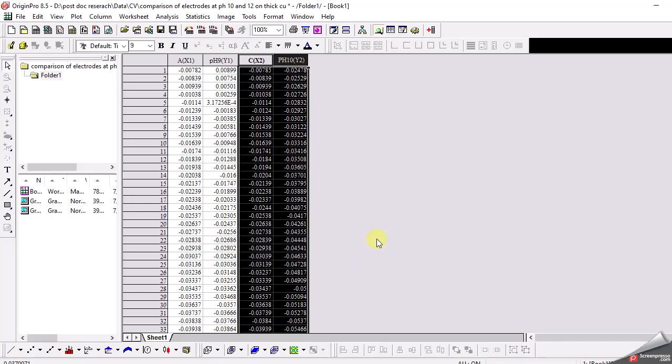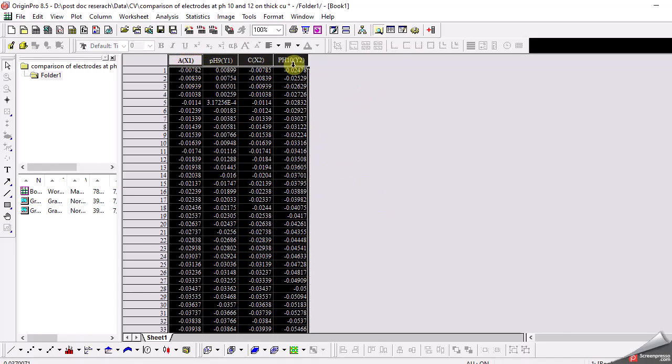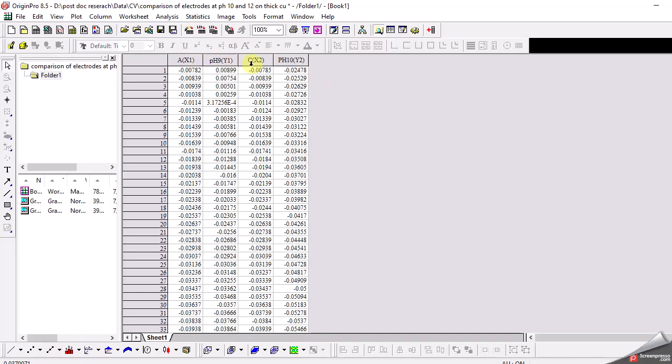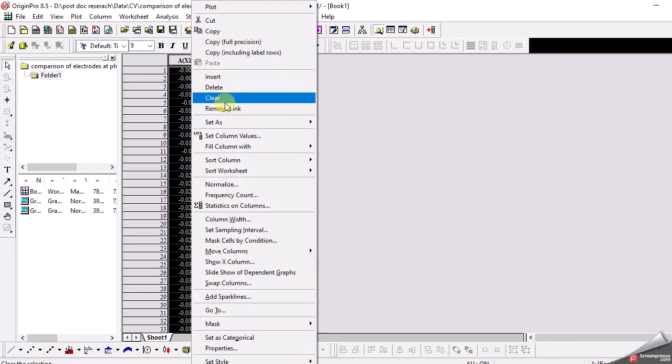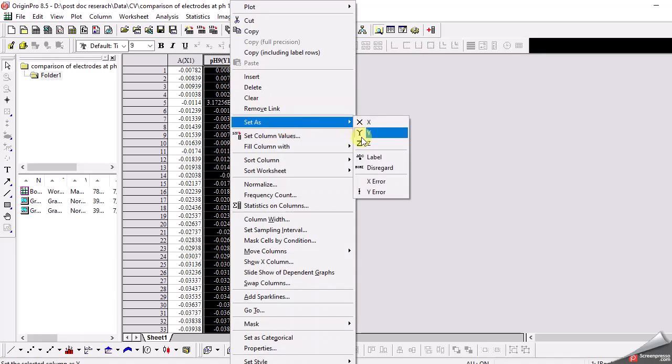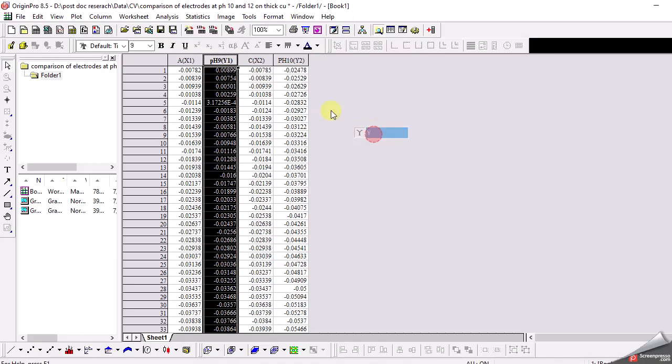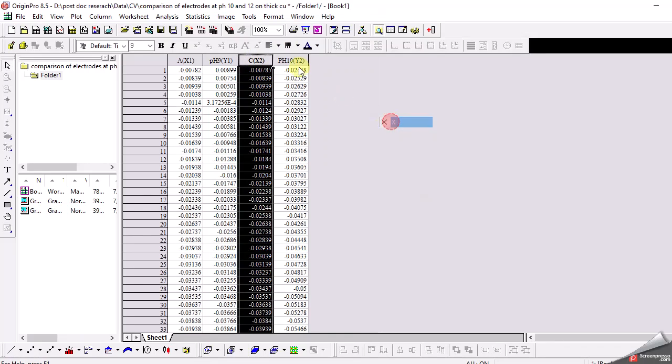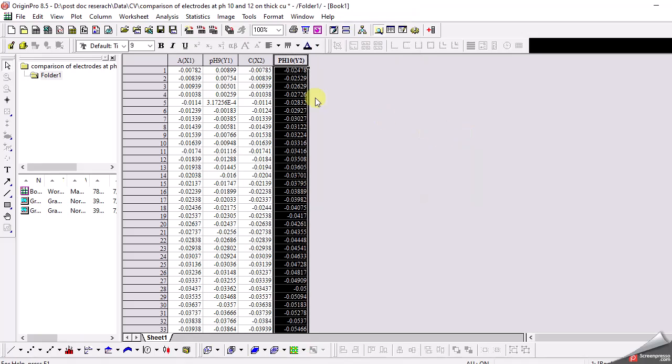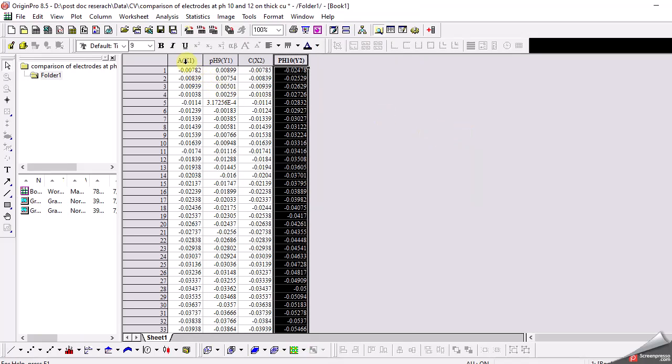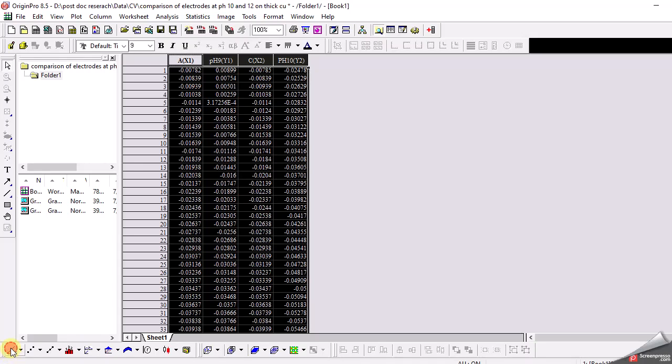After transferring the data to Origin, first we need to select all these columns. Don't forget to label the x and y-axis - this should be set as the x-axis and this as the y-axis, and similarly for the second data set. Now select all this data, and because I want to draw a simple line graph, I simply click this line button at the bottom and here we get a graph.